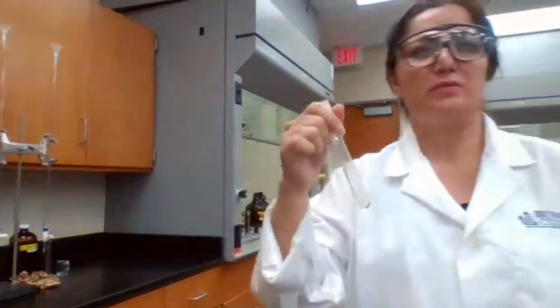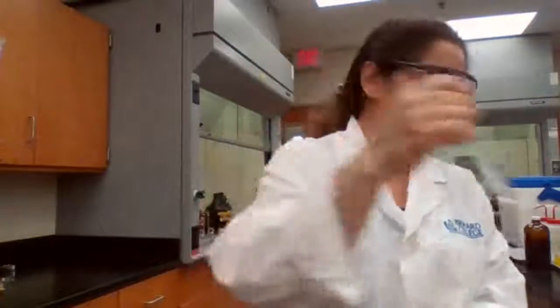Looking for solid ammonium chloride, and it's not here, so I was looking for someone to help me with that.